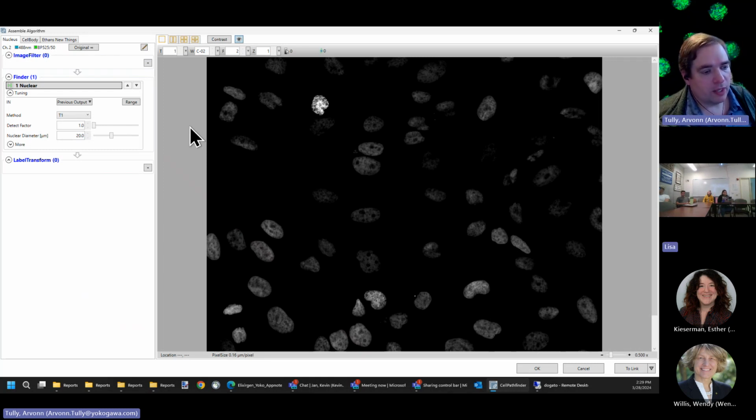Number two, there is a protocol or a special function called CVACE, or Cell Voyager Automated Cell Explorer. So we call it CVACE. And yes, ACE is named for Ace from One Piece, because apparently some of the guys who do programming are One Piece fans. They made up Automated Cell Explorer afterwards.